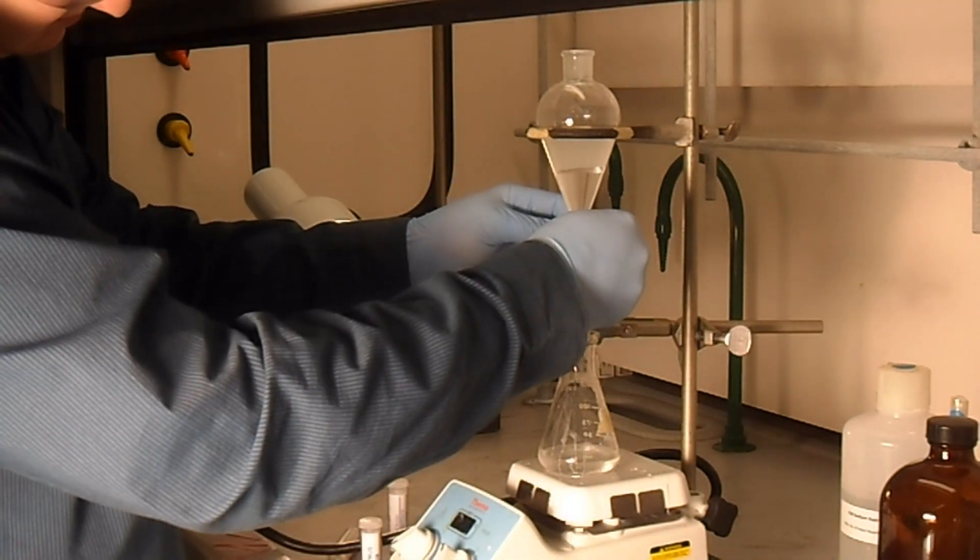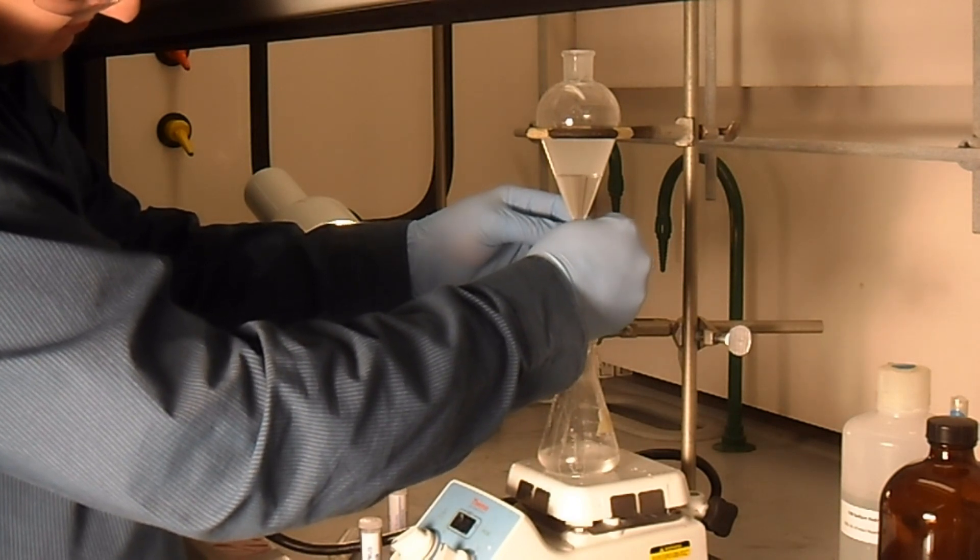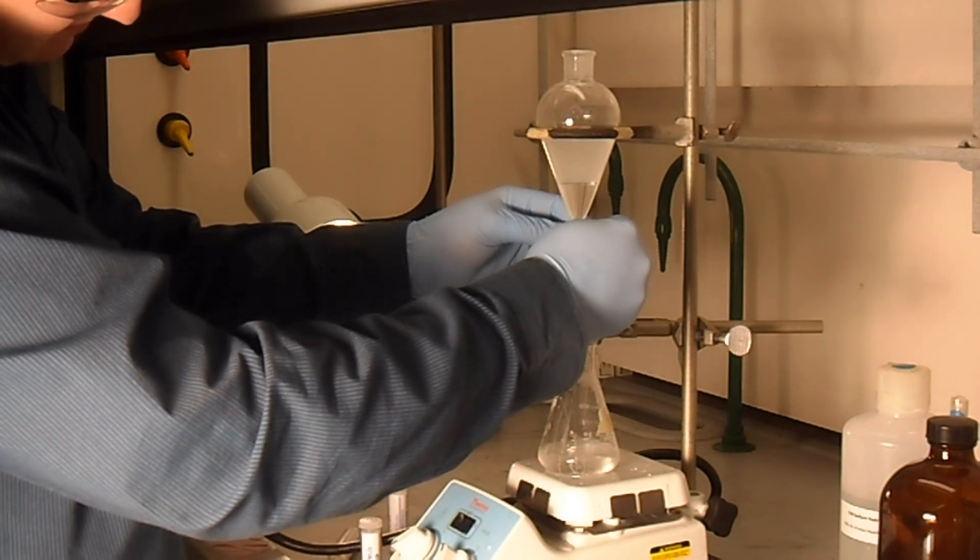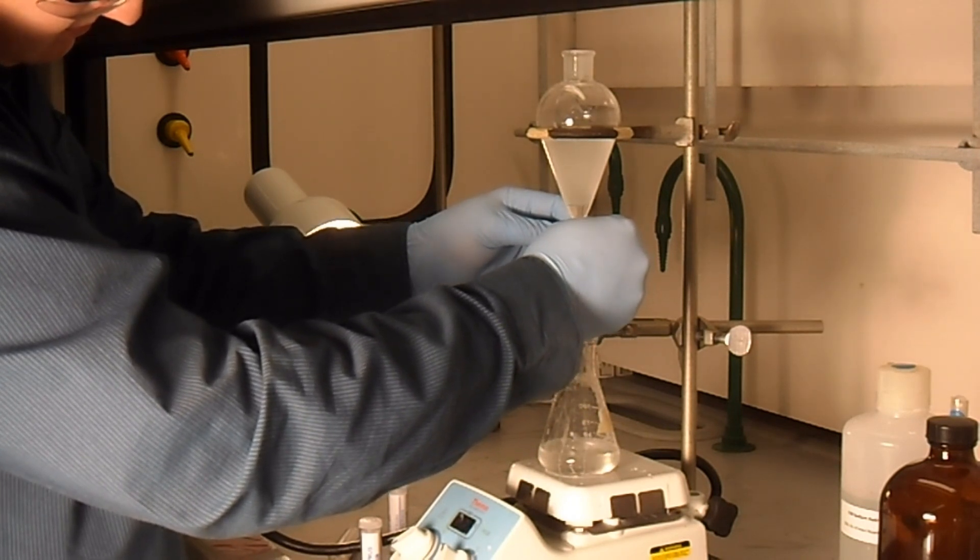Once our layers are separated, we can dispense our second DCM layer into our previous DCM layer. Then, we can use sodium sulfate as our drying agent in this case to dry our DCM.